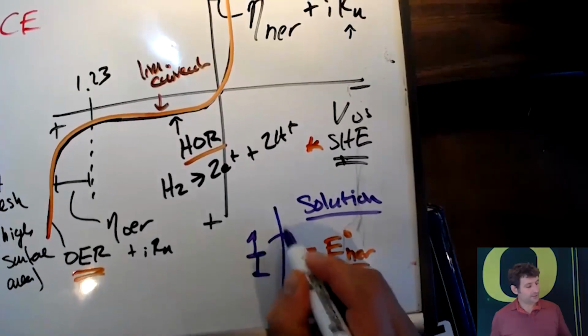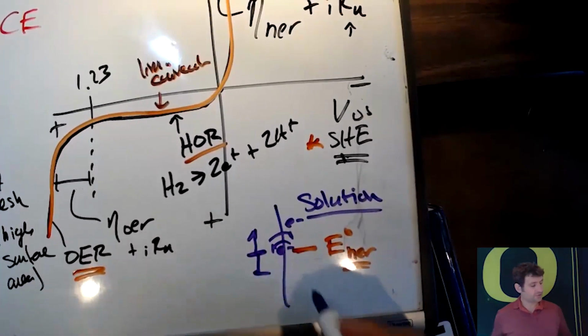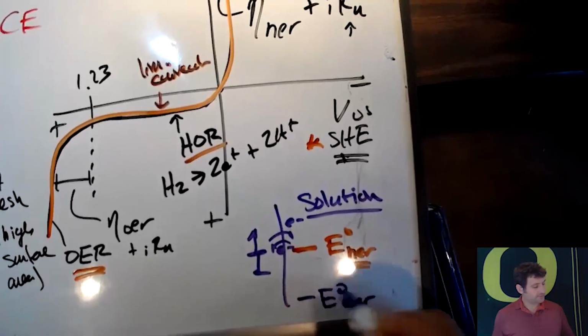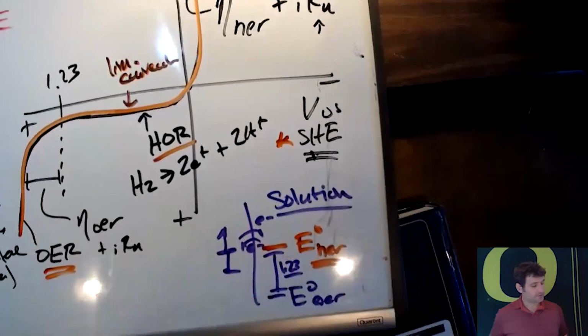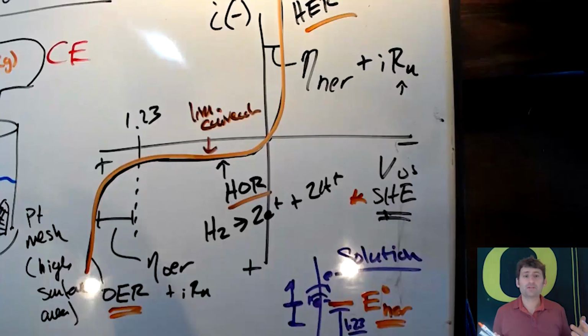I can either put electrons this way, or I can make the electrons go back, and then I can eventually lower the electron energy so much that I can pull electrons out by the oxygen evolution reaction, by pulling them out of water. So we'll go through this in many more contexts, but this is the overview of why we use a 3-electrode potentiostat. Thank you. I'm looking forward to chatting with you again soon.